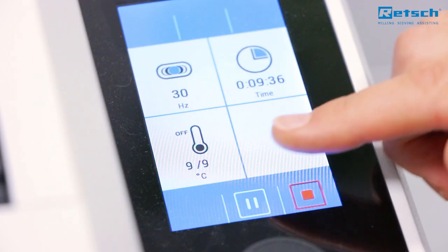This is our new mixer mill. Is your sample material temperature sensitive and do you want to prevent it from heating up? Or maybe you want to freeze your sample material for embrittling?